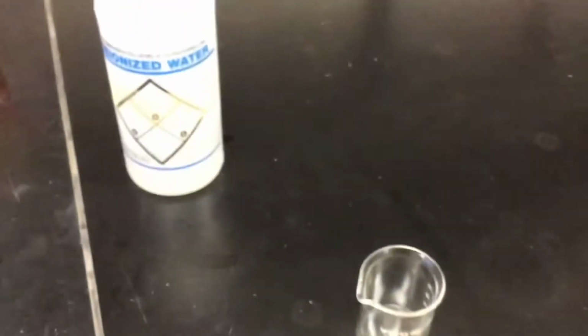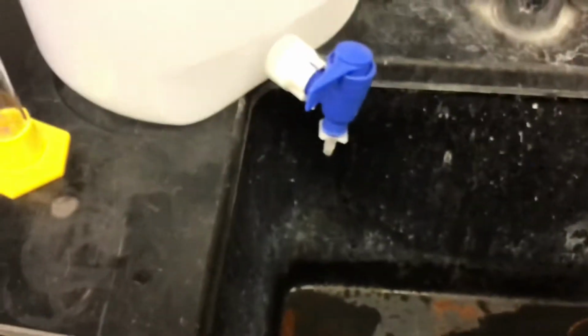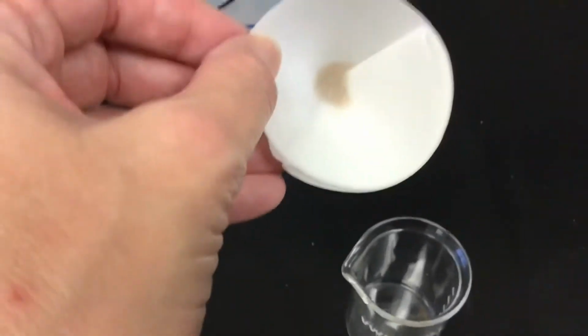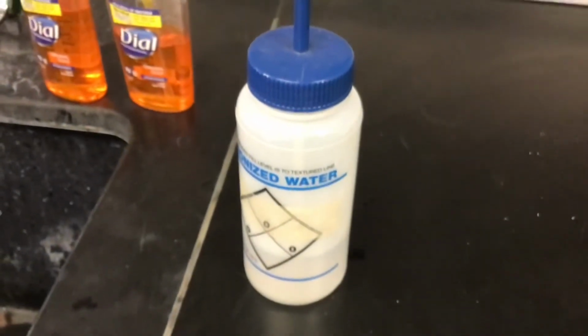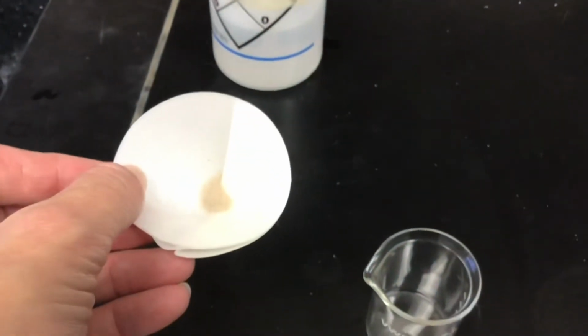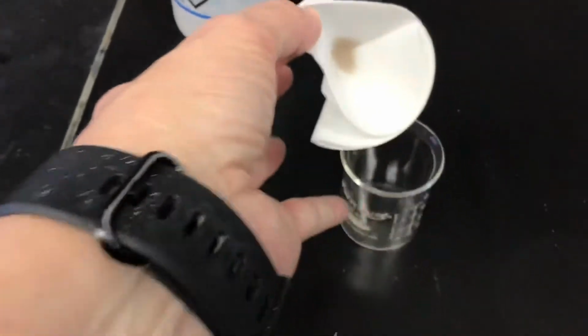So now, since I put that on the hot plate, I'm going to come back over here and I'm going to get my beaker 3. You see my beaker 3? And I'm going to take my sand that is in my filter paper and I'm going to put it in that beaker 3 by using that wash bottle. Okay? That deionized water bottle, and I'm going to spray this right down into this beaker.